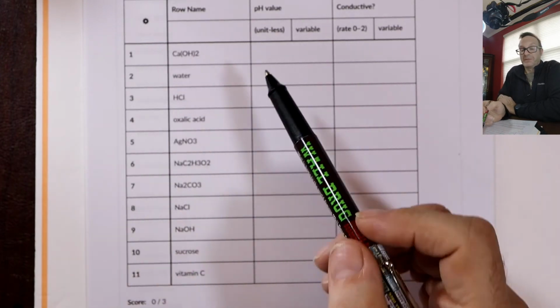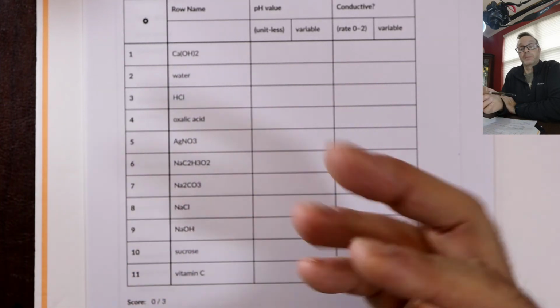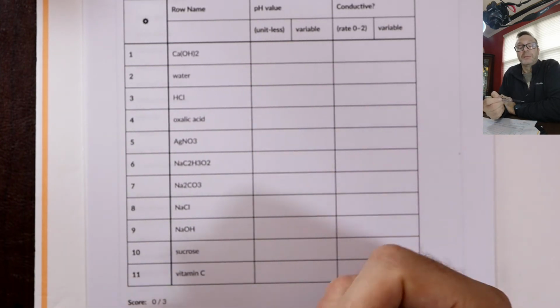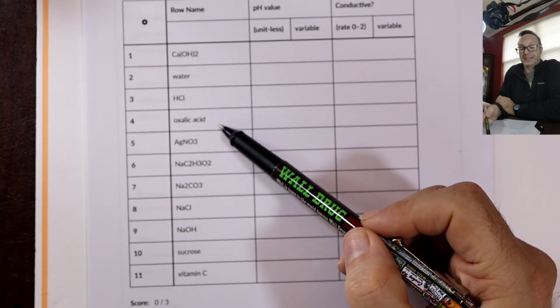Water now depends, right? Water in the purest state is essentially non-conductive. But tap water is conductive because of ionic impurities. So pure water has super low conductivity, but if it's tap water or salt water, even seawater, it should have a higher one. Strong acid, lots of ions. Oxalic acid, weak acid.